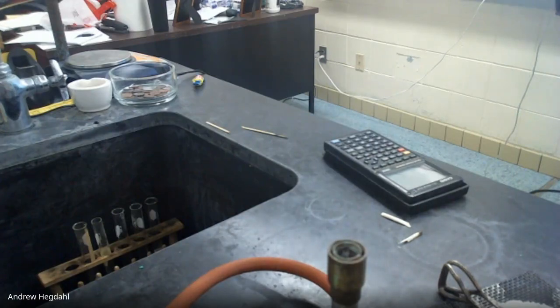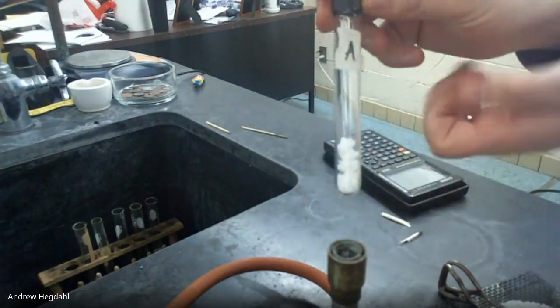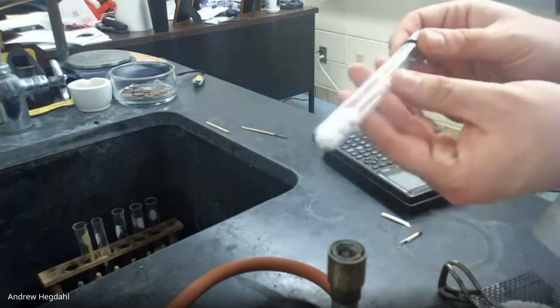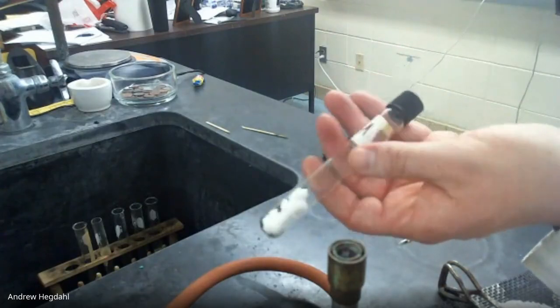All right. So our camera. We are. Okay, so this is sample A. And you could describe these however you want. So it looks like they're kind of like clustered crystals for sample A.